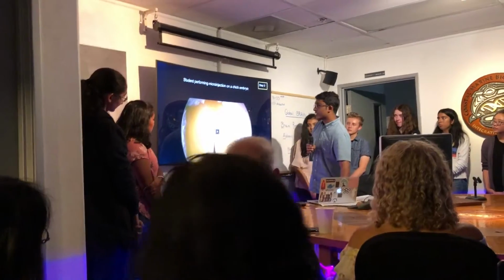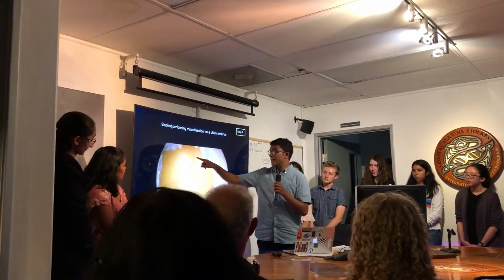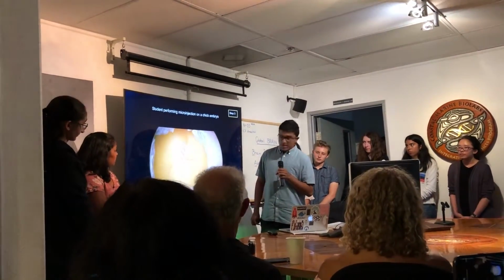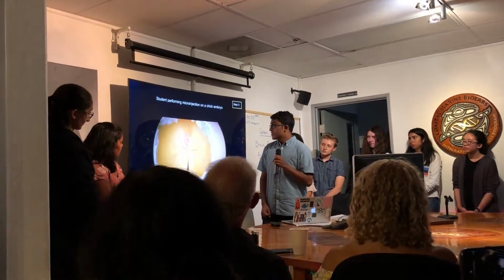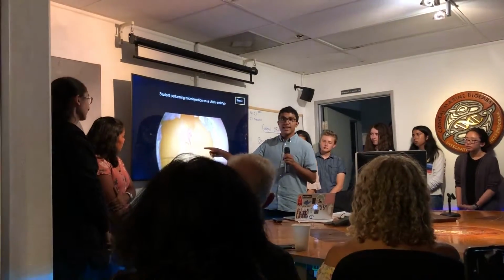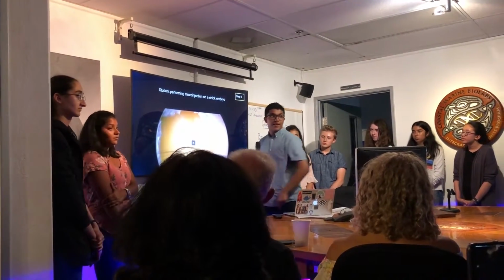So here's a video of my colleague Sarah performing this microinjection on a chick embryo. So as you can see, this right here is going to become the head. This is the beating heart. This is going to become the tail. We call this the caudal region. And so Sarah's preparing to inject it right now. So she punctures the neural tube with the microinjection needle. And as you can see, the indicator dye and the destination vector travel from the caudal region all the way up to the hindbrain of the chick embryo.